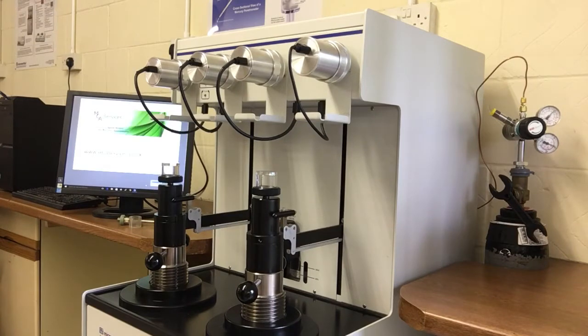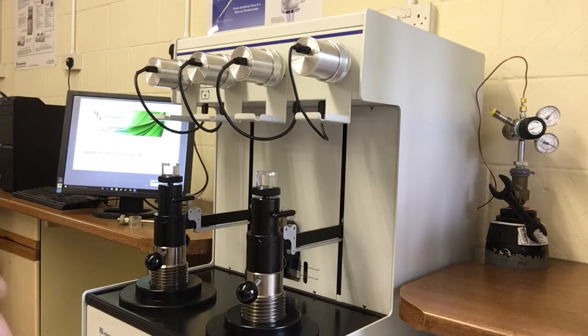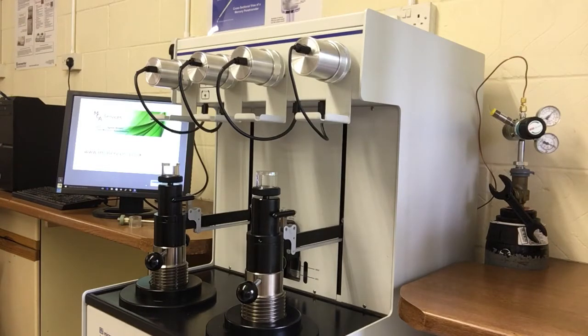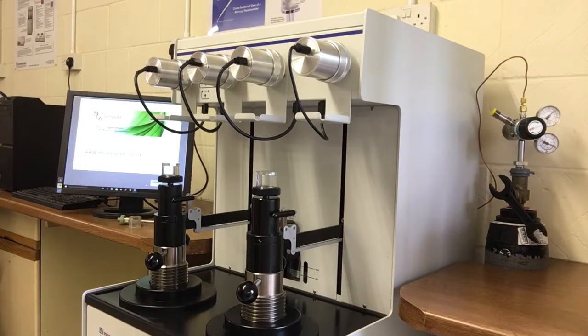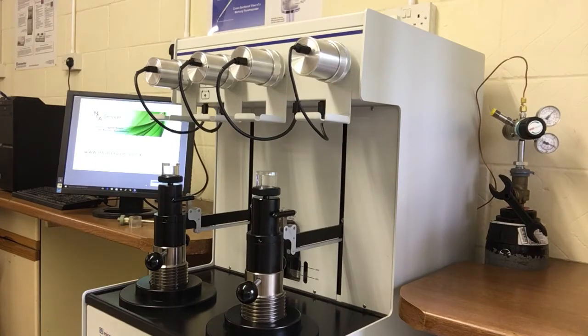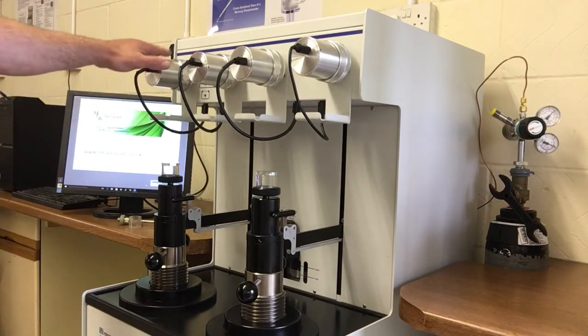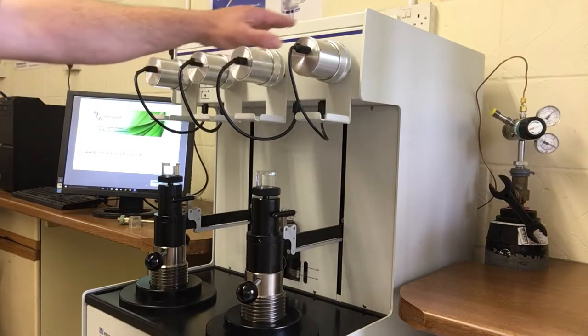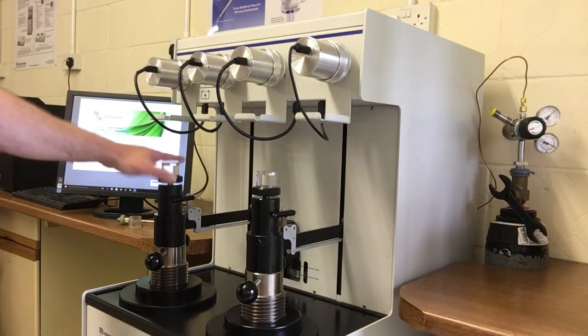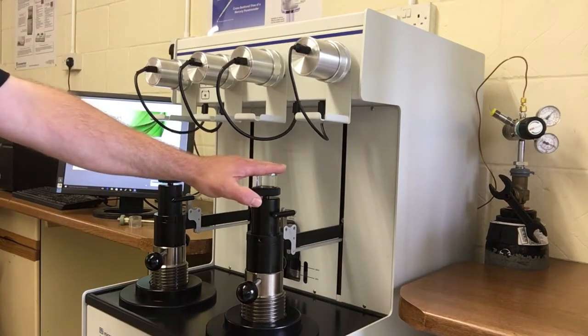So this is the Micromeritics AutoPore 5. We're just showing the top section of it here because these are the parts that we interact with during the analysis. And an analysis is divided into two parts: the first is low pressure, the second is high pressure. Now this configuration has four low pressure ports across the top here and two high pressure ports.